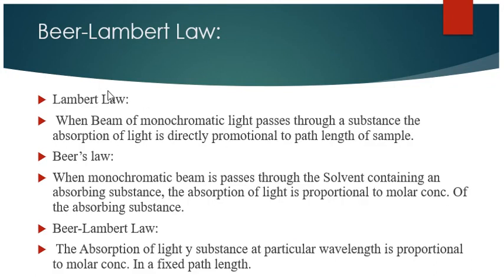Now we have Beer-Lambert law that describes the absorption of these radiations by the matter or the solvent.